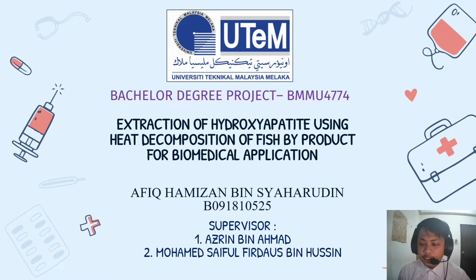My name is Afiq Hamizan bin Syaharudin, under the supervision of Mr. Azrin bin Ahmad and Mr. Mohamed Firdaus bin Hussin. Today I would like to present about extraction of hydroxyapatite using heat decomposition of fish byproduct for biomedical application.